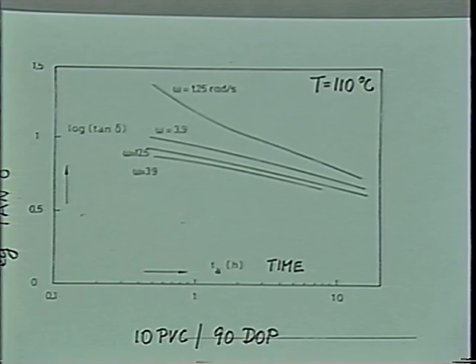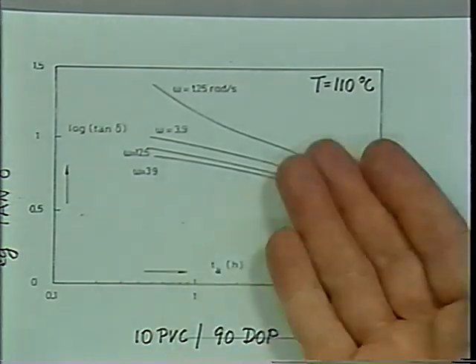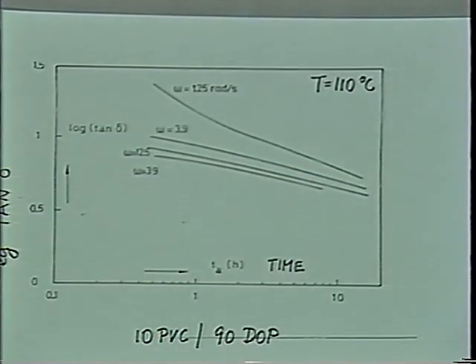The material is always liquid. It never gels. And you can see that from the experiment immediately. You could stick your sample in the rheometer, and in 1 hour you know that this is never going to be gelling. You have to go to lower temperatures to do that. Or you go to a different solvent.